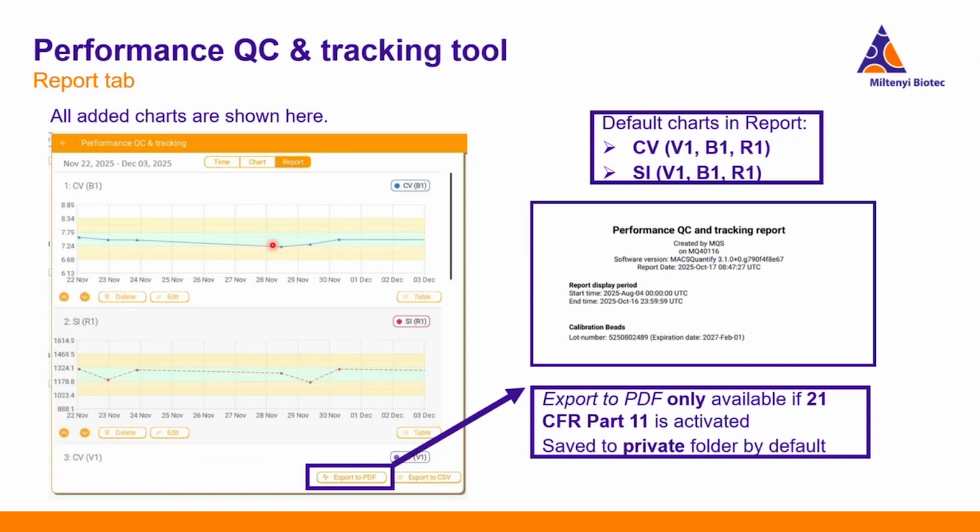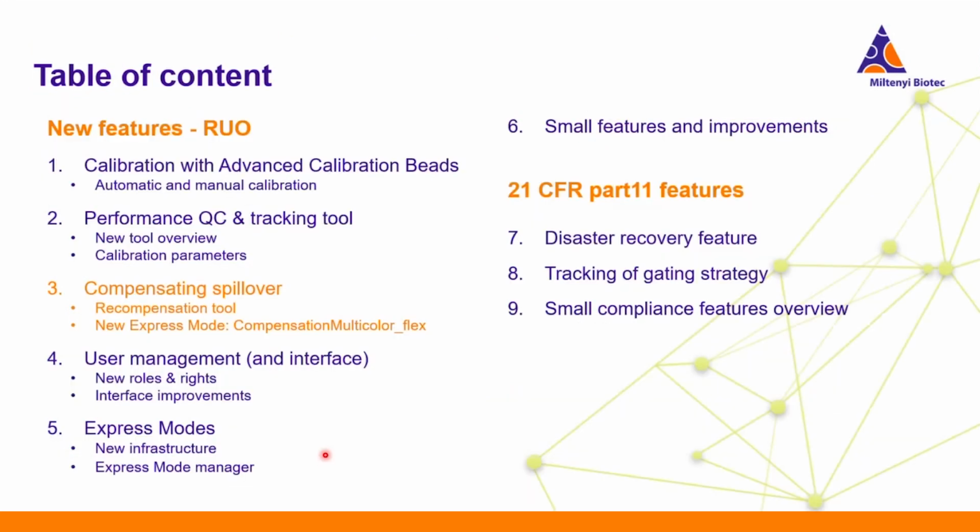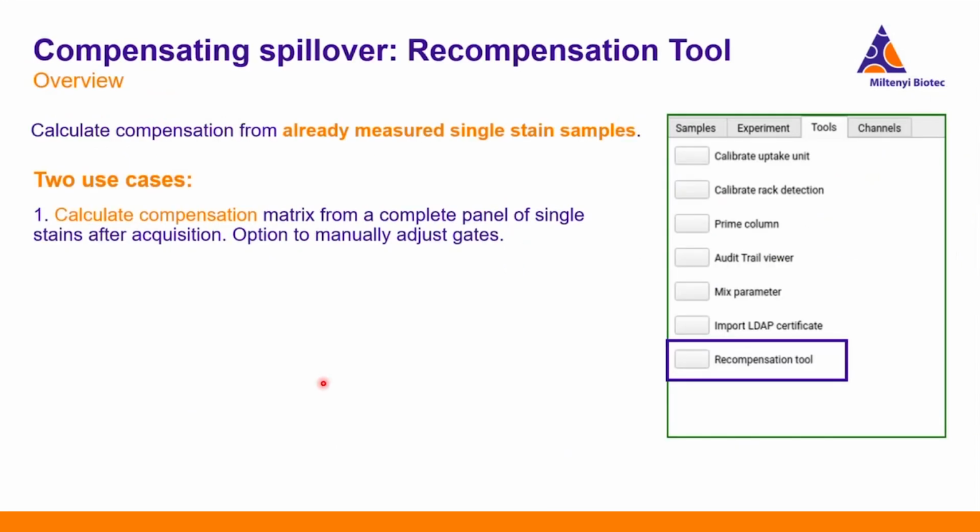Yeah, but this is how the tool looks like. Let's continue with the next topic, which is compensating spillover. As I said, there are two new tools. One is the recompensation tool, which you can access under Tools, Recompensation tool, as the name says.